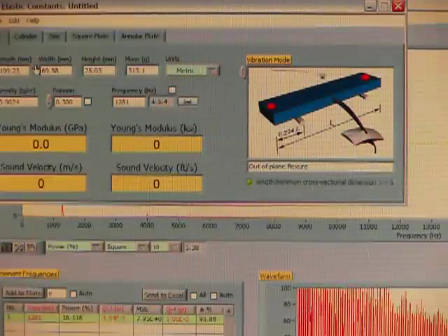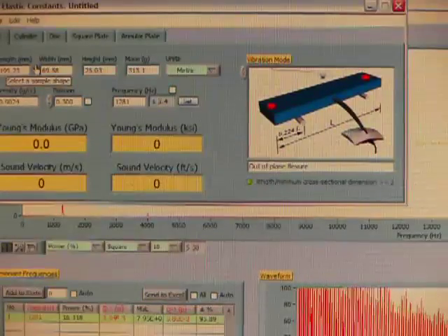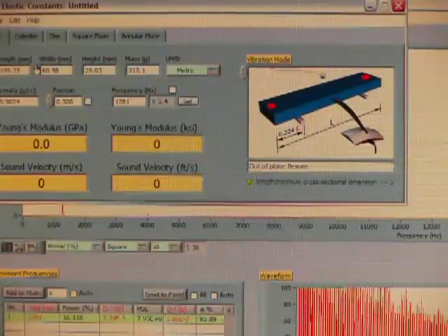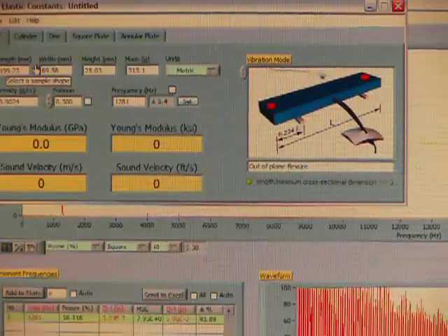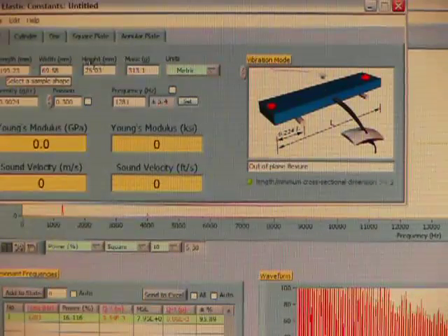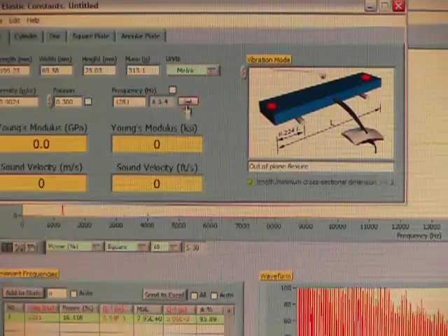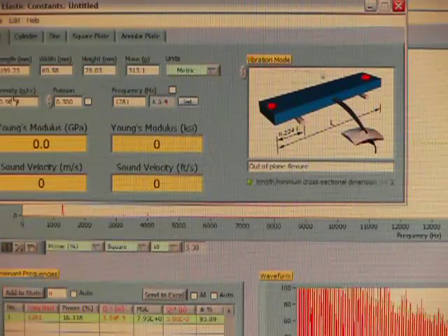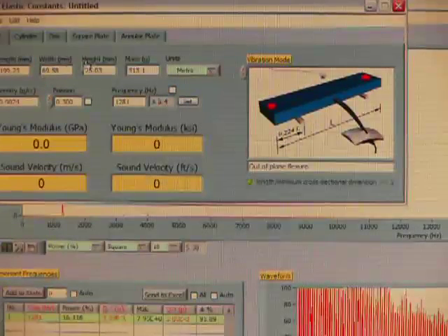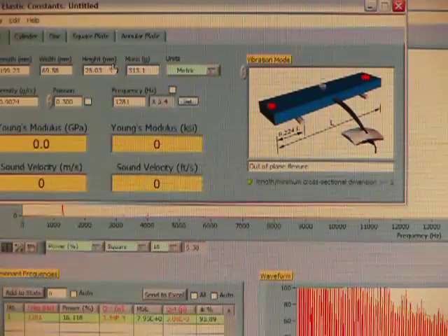Now I've already filled in these values, but basically you fill in the values. You've selected the units, fill in the length, the width, the height, the mass. Then you're set to go.